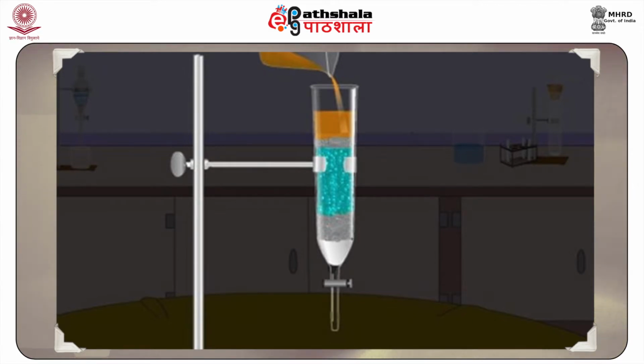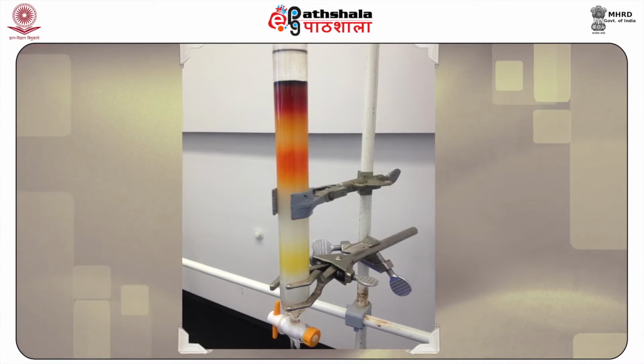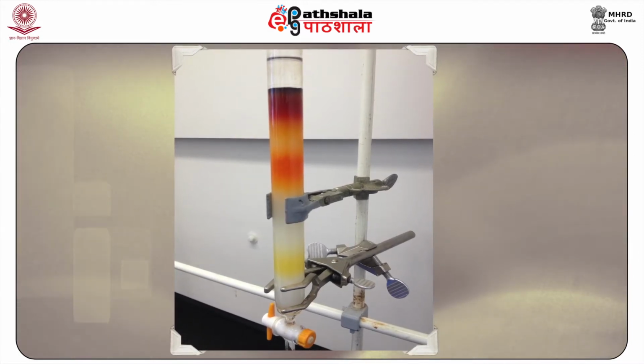During this process, the eluent is gathered in a series of fractions. A fraction collector automatically collects these fractions. The chemical composition of each fraction is analyzed by any of the following methods: UV absorption, fluorescence, etc.